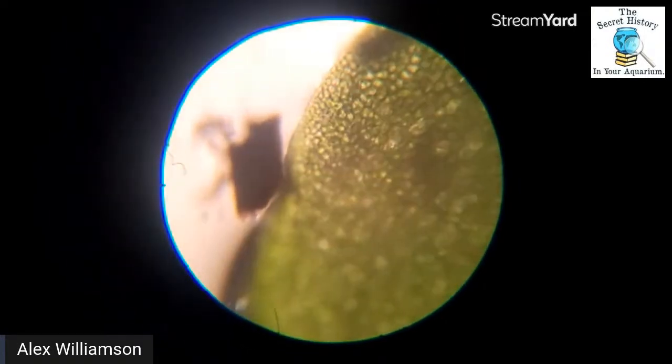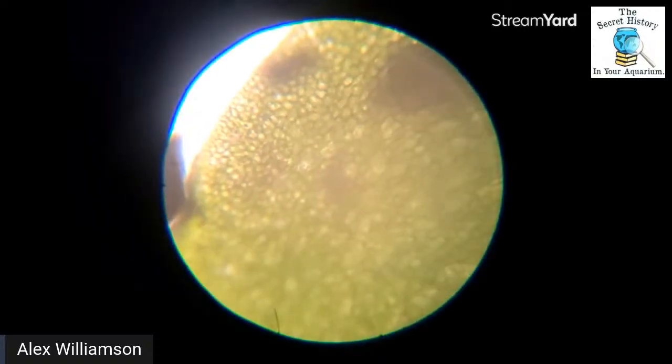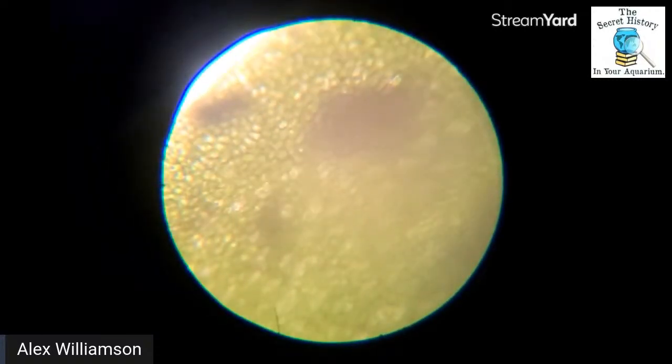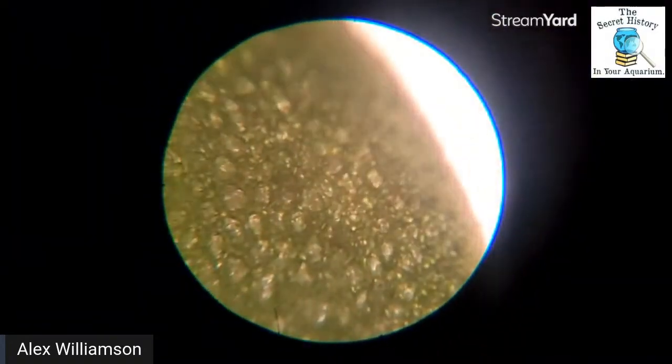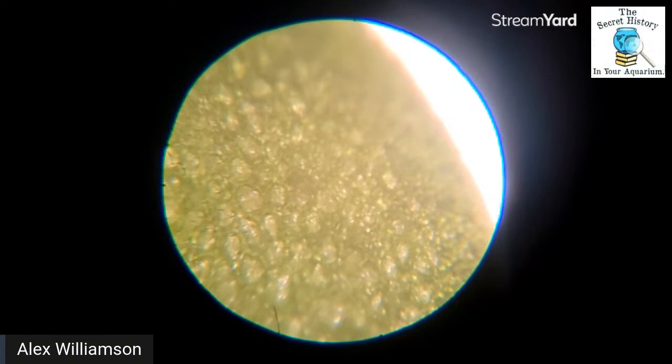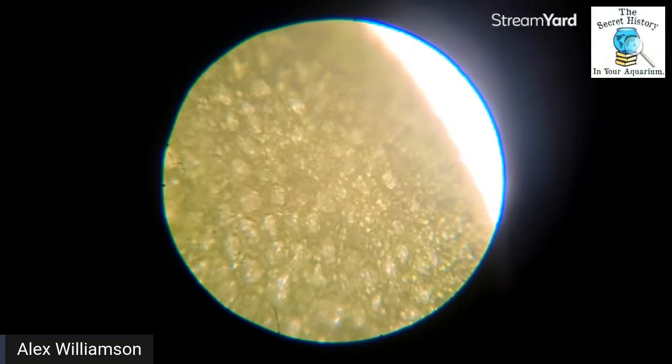Yes, thank you, Thomas Hines. Cell walls are made up of a polylipid that is hydrophobic. Yes. And that means they push away water, in short. And that's what you can see. See the water forming up on each cell? There's actually water kind of condensing on each one, which is kind of cool.